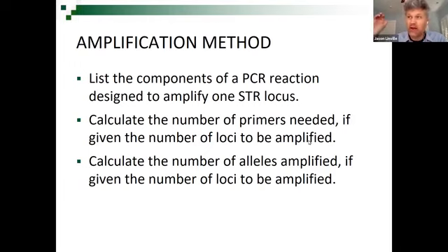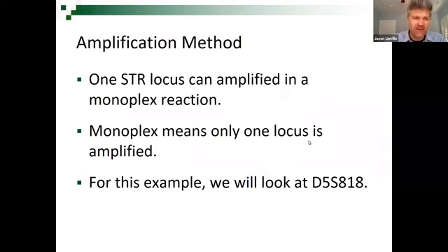So I'm saying you're going to amplify 7 loci in this reaction. How many alleles will you wind up observing after the reaction is over? And you're going to have to give me the answer to that. It's going to be 14. It's times 2. There, I saved this all to 10 minutes. No, but let's actually look at why it's times 2 for both of those.